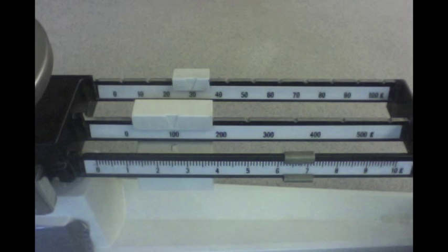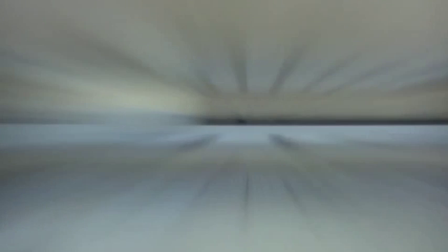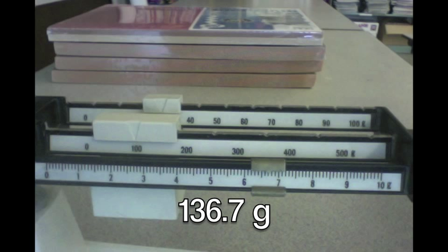If we look really closely, we'll notice that there are ten divisions between the six and the seven. And our little pointer on our slider is pointing to the seventh division. So that means it's reading at six point seven grams. So our final answer is one hundred thirty-six point seven grams.